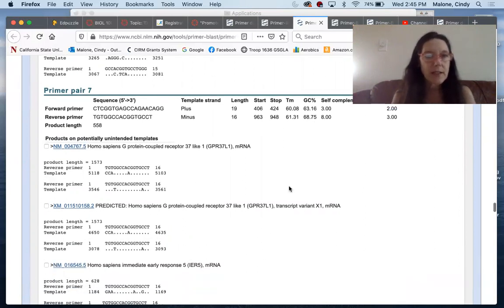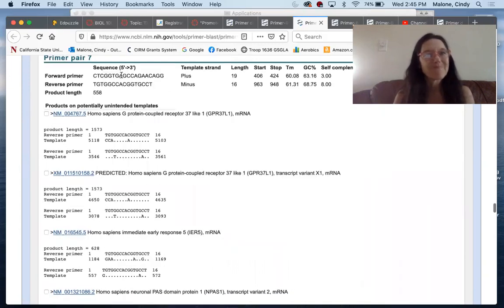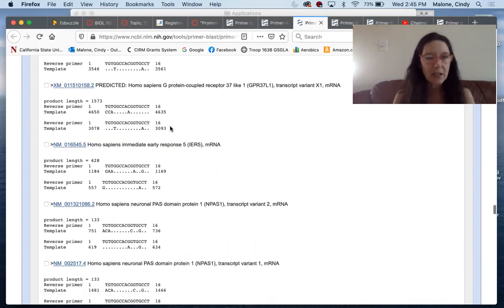And then where it's going to sit, again, this guy's going to sit in a G protein coupled receptor, like blah, blah, blah, RNA. 1500, that's big. Yikes. 628, 550 to 620, you can resolve that, but we kind of just want to look at a gel and go, yay, and not have to measure to the markers and really get crazy. So that makes me a little uncomfortable.